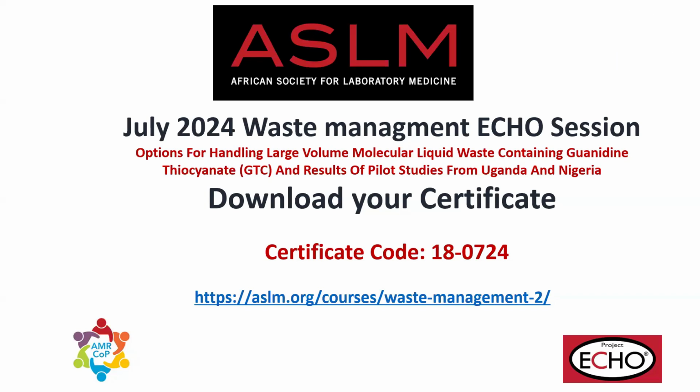Thank you very much for that question. So what is happening is that the current lab that is being supported in this effort is the Ministry of Health lab that tests all the samples coming in from throughout the countryside to a centralized point.